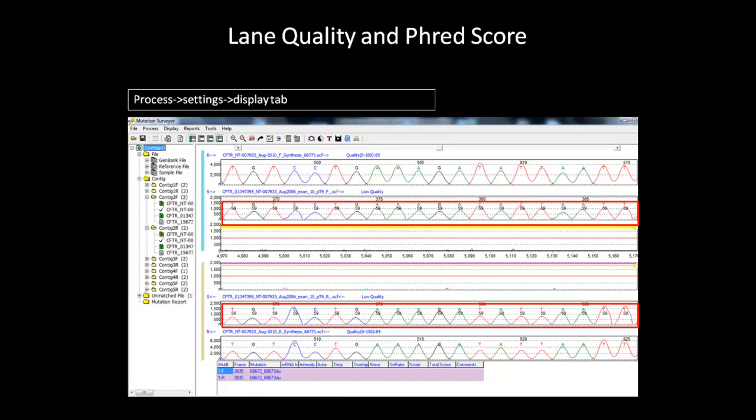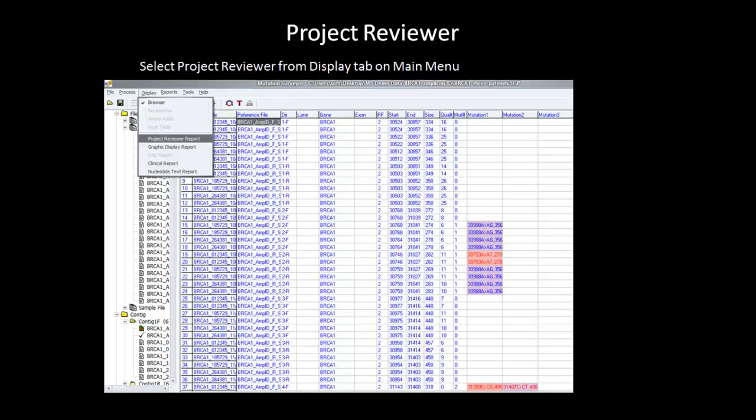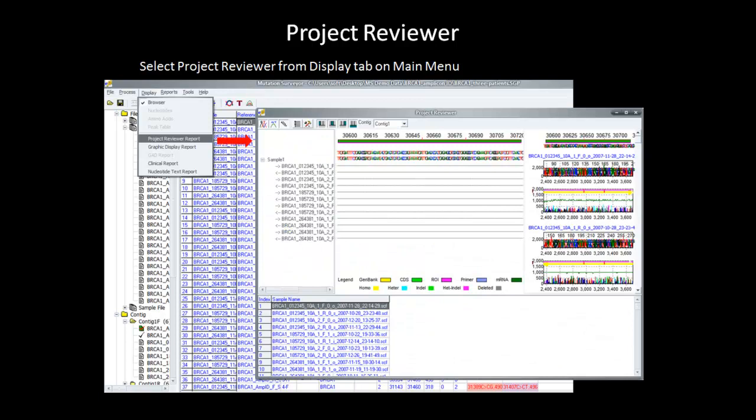This reviewing method allows you to see if the mutation call within a certain sample is reliable based on the overall quality of that sample. To further review the data, you can use the project reviewer to view overlapping amplicons. The project reviewer can be easily selected from the Display tab on the main menu toolbar. This tool offers an alternative view to the main analysis window of the project and can only be selected after the analysis is completed.